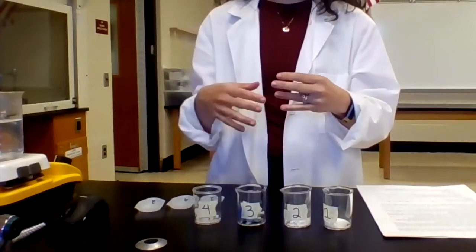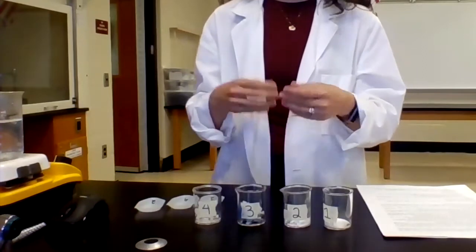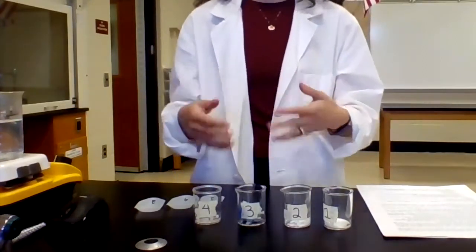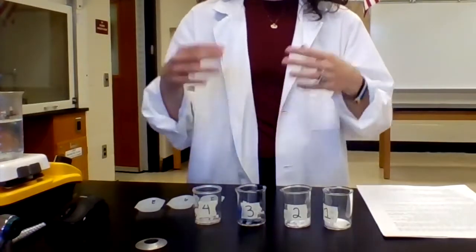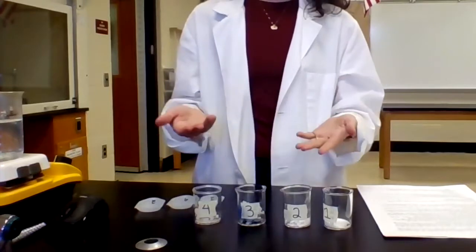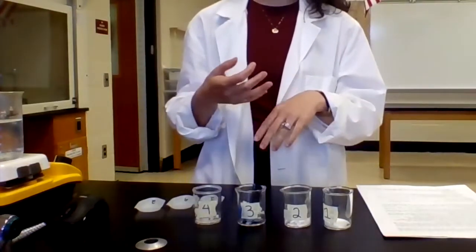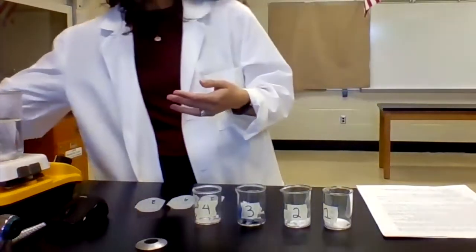Now, we're going to do a lot of different tests, but the first test that we want to do is test if it is able to conduct in the solid state. The reason for that is I know that only metals conduct in the solid state. So if I see that something is able to conduct when it's a solid, I don't need to test any of the other properties. I don't need to go through the melting point, the solubility, the conductivity in solution.